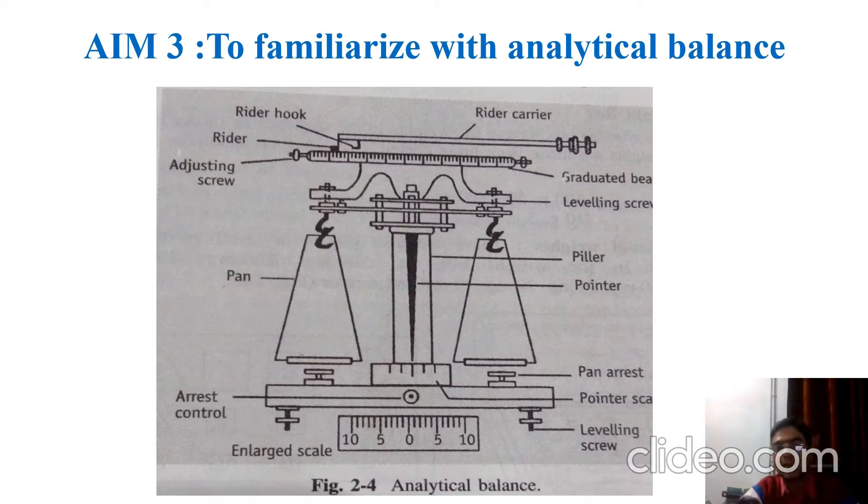The left-hand pan is used to keep the compound or drug that we have to weigh, and the right-hand pan is used to keep the weights. At the bottom we have the leveling screw, which is used to adjust the balance properly so that there is no disturbance. This is all about the analytical balance.